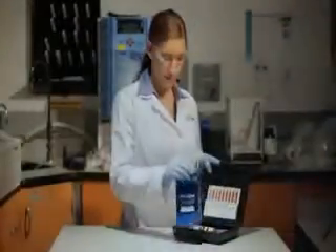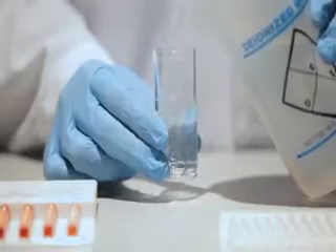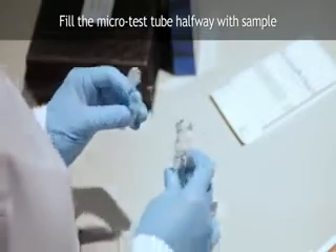To perform a test using VACUETS, fill the diluter snapper cup to the milliliter mark with purified water such as distilled or deionized water. Fill the microtest tube approximately halfway with the sample to be tested.